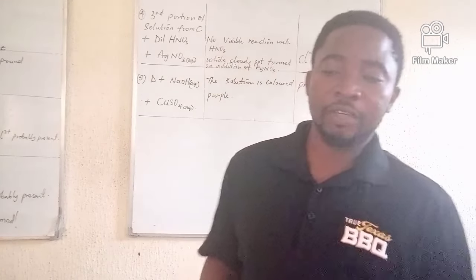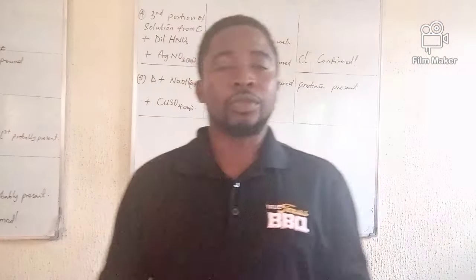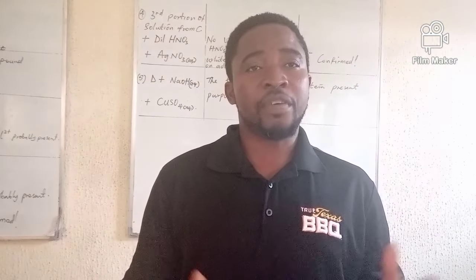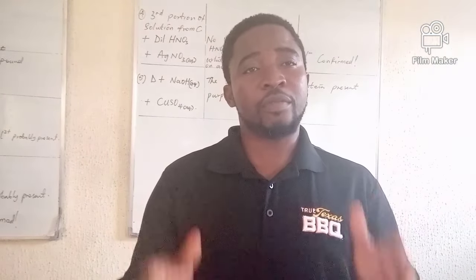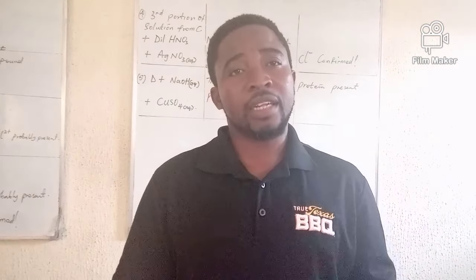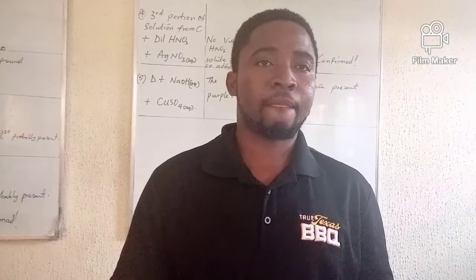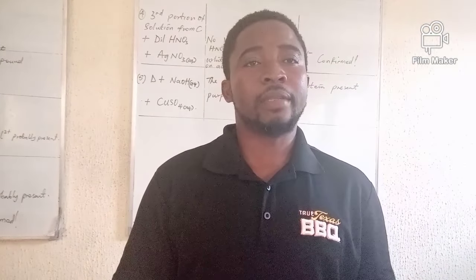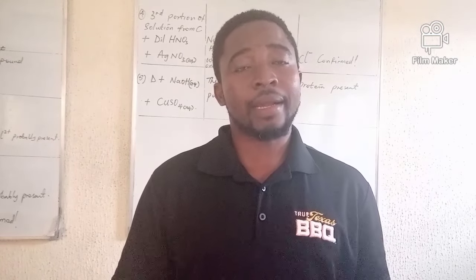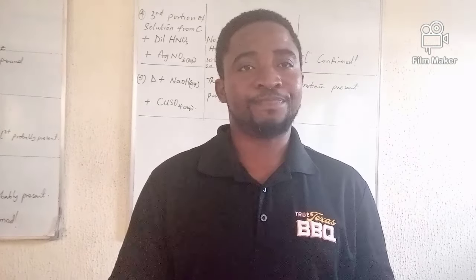Now, already I have at the board the observation table. My observation table is always tentative. If you've been following me on this channel and watching my videos, you will observe that I'm always tentative in my descriptions. We're going to be looking at the expected questions that might likely come out in this forthcoming NECO chemistry practicals.